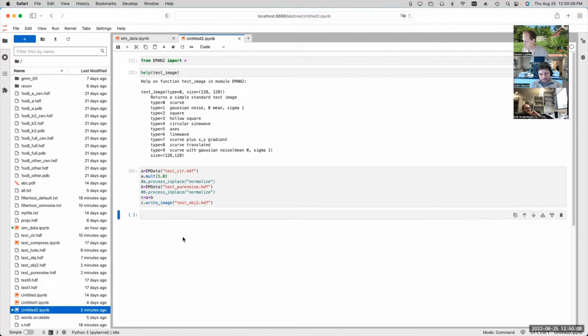Well, it depends on if you want the object to be really an artificial object where you have a proper ground truth for it. I would probably just go into a paint program and draw a picture, and then use that as a mask. Gotcha. Right. So I used a circle as a mask here, but you could use any other image as a mask if you want. It should just be 1 and 0. In fact, you could draw it and then maybe low pass filter it slightly so it had a slightly soft edge. That might be a worthwhile thing to do. Anyway.